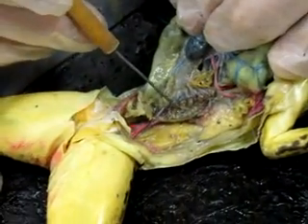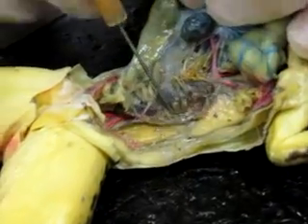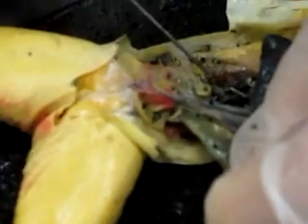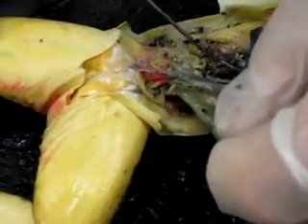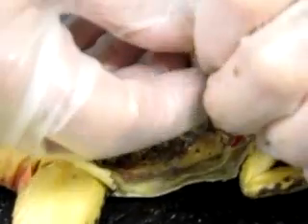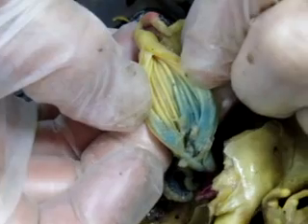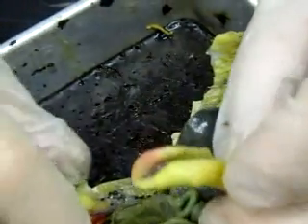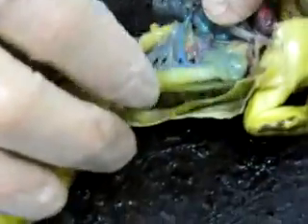Now, along the back wall, we'll have this structure, which is my kidney. You can see the kidney here, and there's another one on this side. This one's been kind of ripped open, but that's my kidney. Now, if I open my stomach up, I'll find on the inside of my stomach the ridges, called rugae. That's the ridges on the inside of the stomach. Okay? So that's my digestive system.